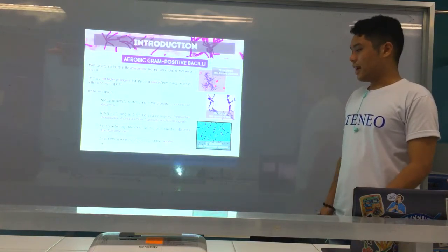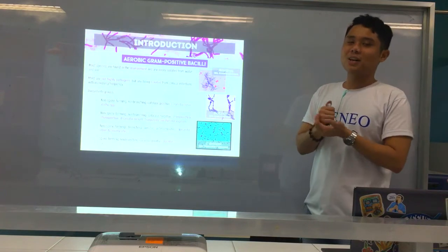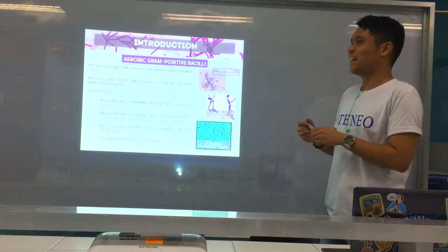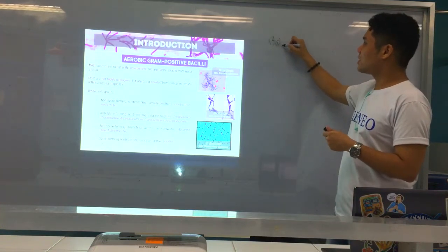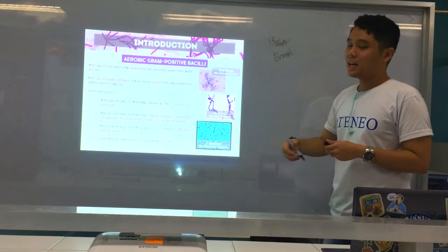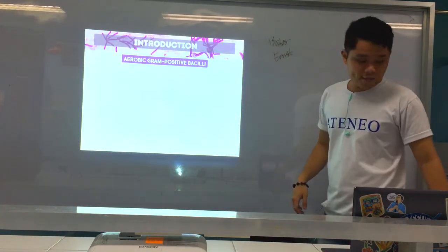And there are the metachromatic granules of C. diphtheriae, which I mentioned in intro to micro, the Babes-Ernst granules. That's really specific for C. diphtheriae.